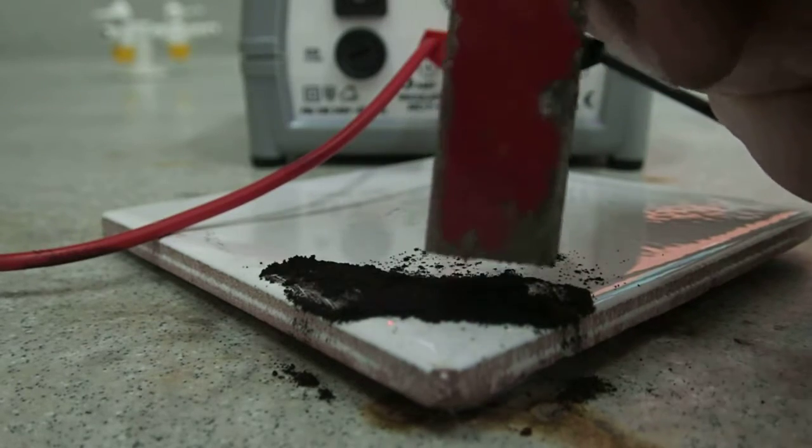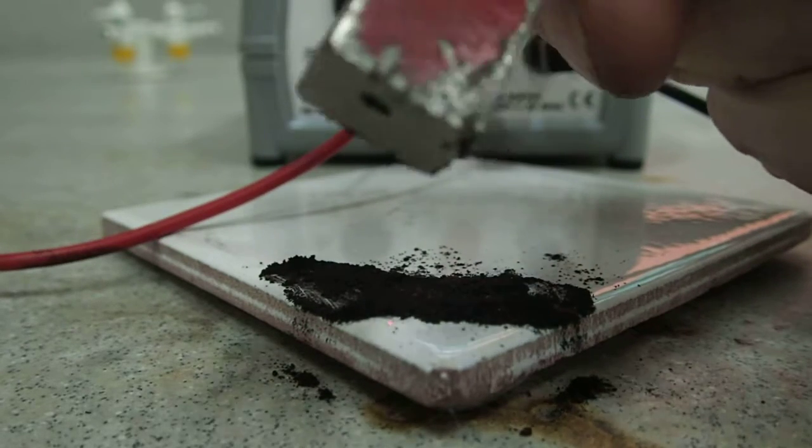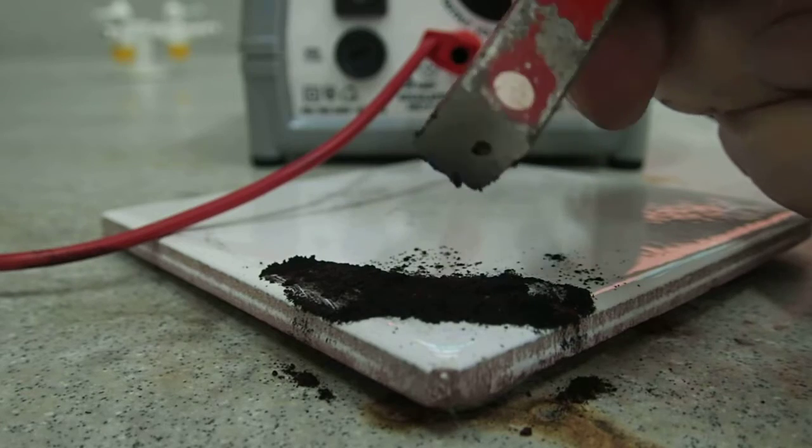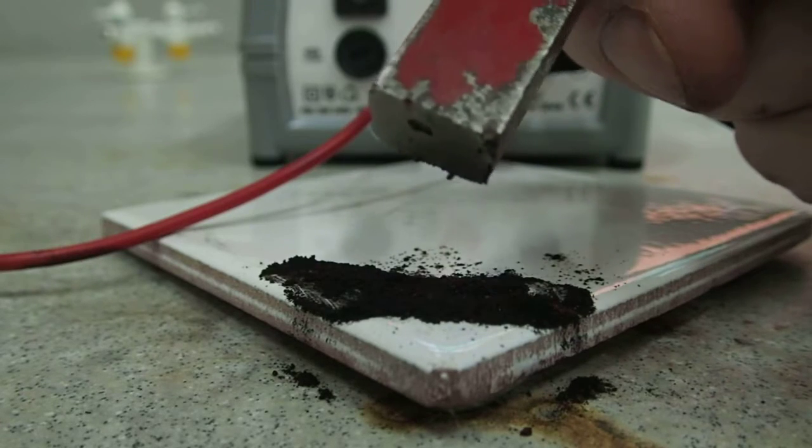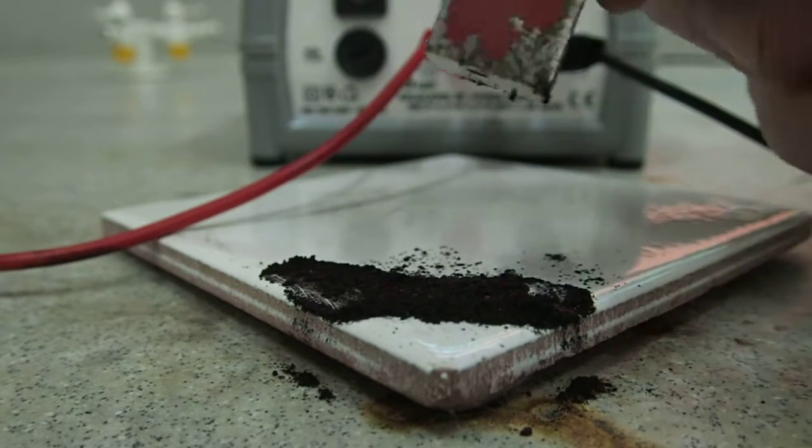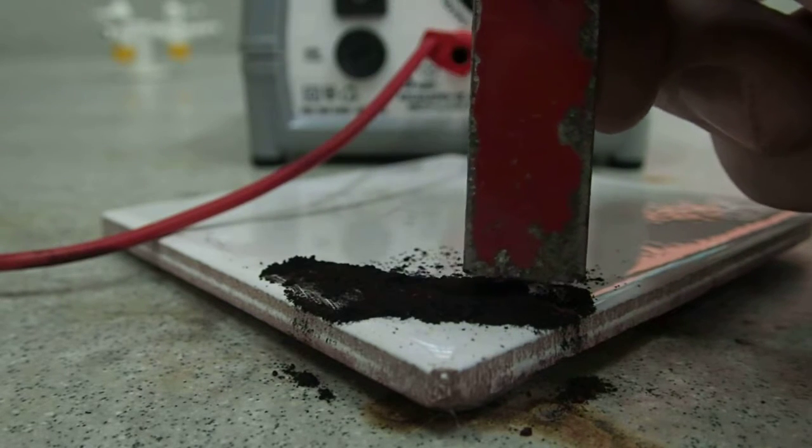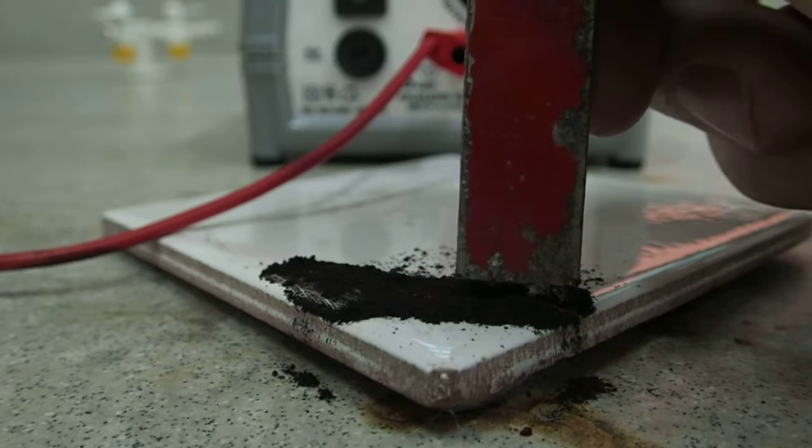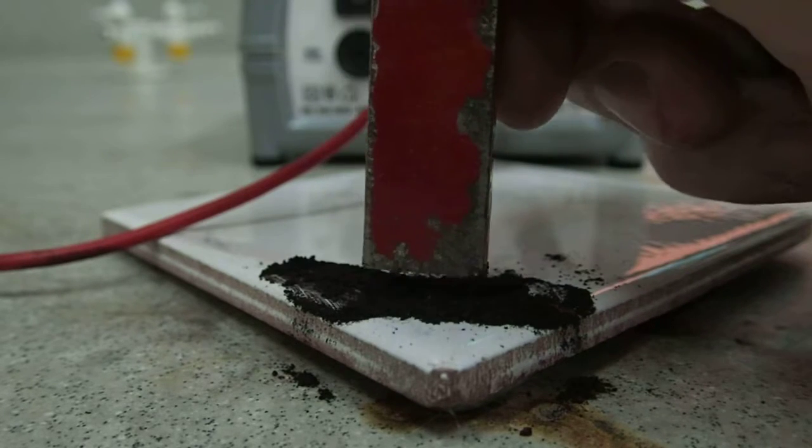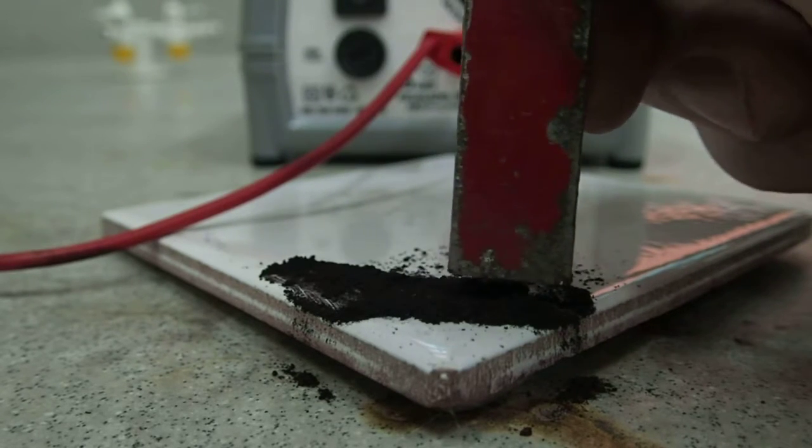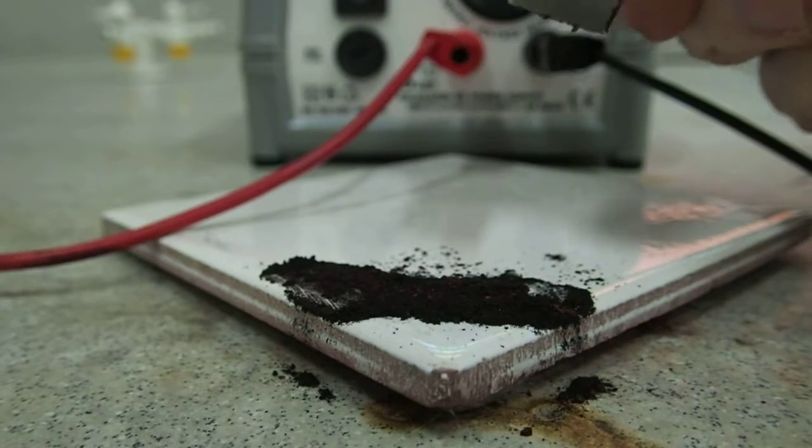There they are, attached to the bottom of the magnet. Can you pick those up? Those are tiny little iron filings that weren't there before. So there we are, the extraction of iron from iron oxide in less than five minutes.